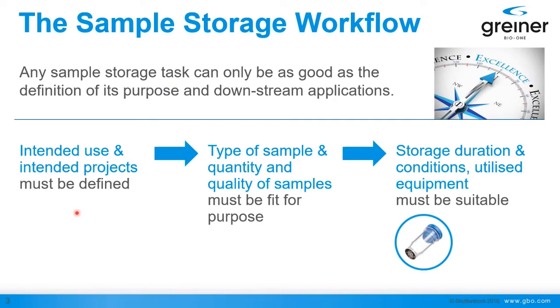Starting from there, we go back and say, okay, if this is the intended purpose of our project, then this would be the amount of samples we need, the quantity and quality of samples we need. And the samples must be fit for purpose, so that the whole project makes sense. It's a different story if you offer, let's say, cells for DNA isolation, and this is the purpose of your project, or you offer cells or serum to analyze biomarkers in it. That's a whole different story.